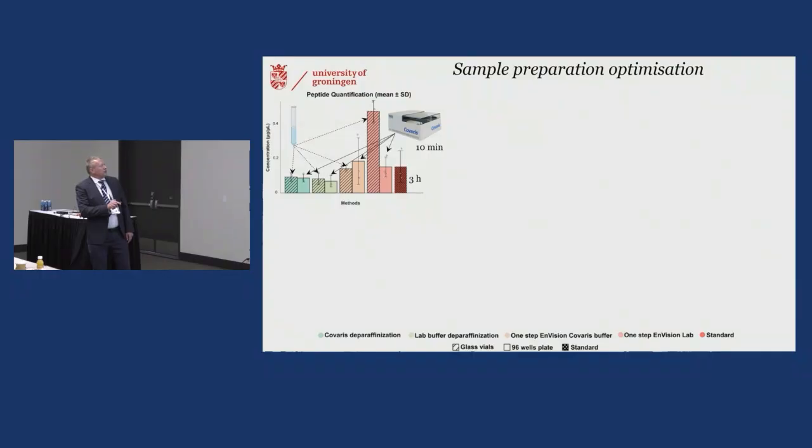These dashed columns are related to glass vials, which are very hard to automatize, and that's why it takes a lot of time to analyze one sample. With Covaris, the processing time is much lower. We get higher concentration for the glass vial, but the concentration that you get here with the Covaris was of sufficient quality to enable high throughput profiling.